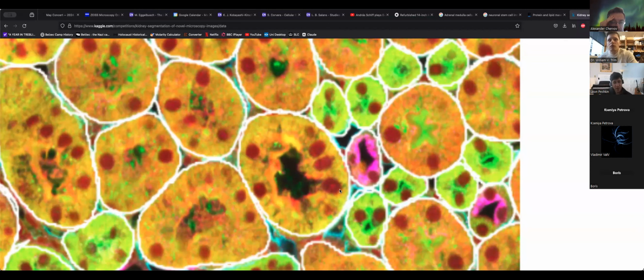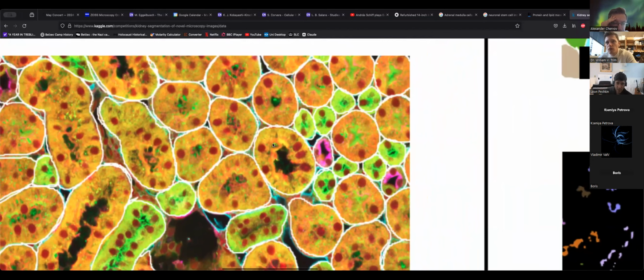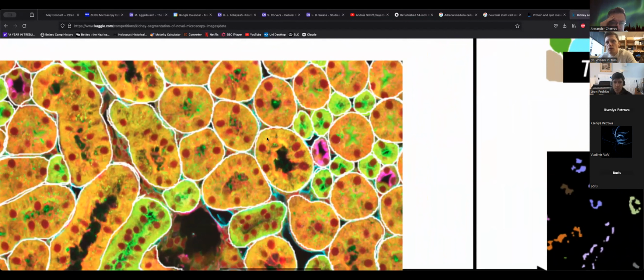Okay, so now around each nucleus, there is a cell, and cells are arranged into elliptical shapes themselves. Maybe, Will, you can just point. You can see my mouse? Yes. So, effectively, for kidney specifically, individual cell type extraction is incredibly difficult because we see here in this shape, there are maybe eight individual cells that make up this. So for kidney, it's not quite so easy. So we're treating a tubule as one cell proxy.